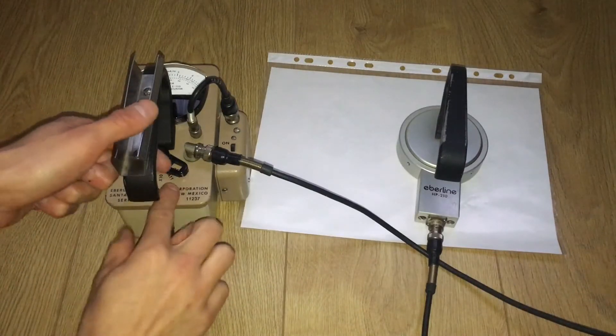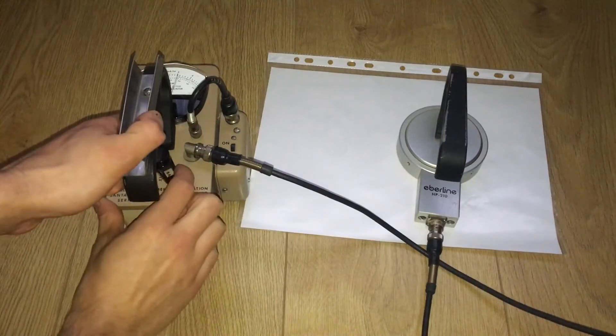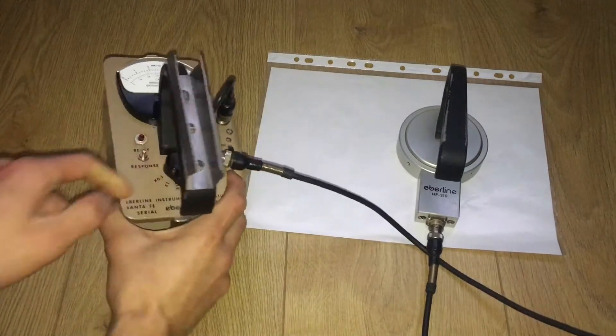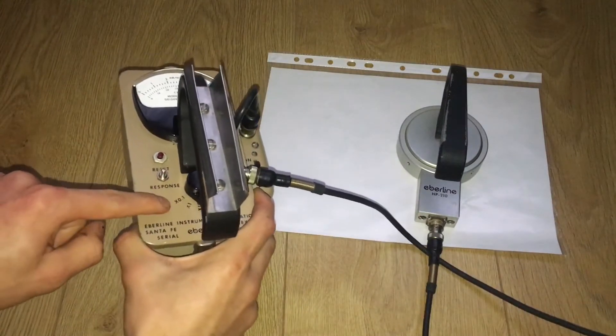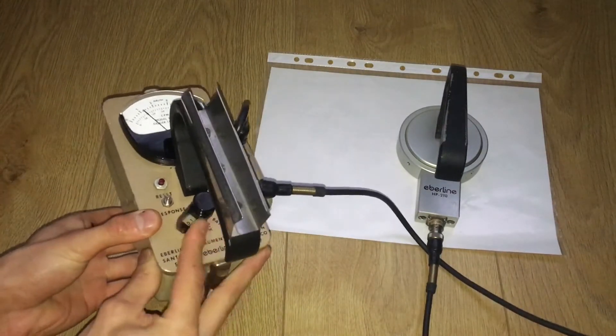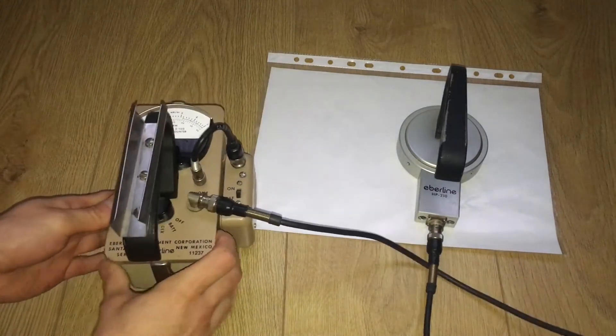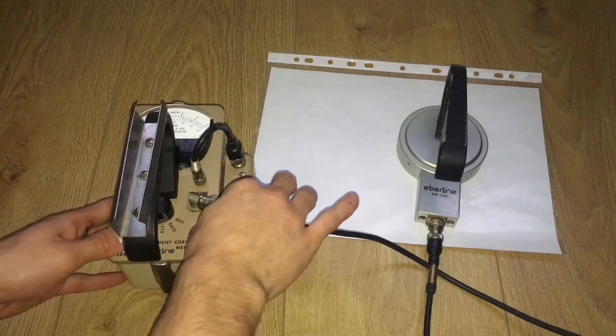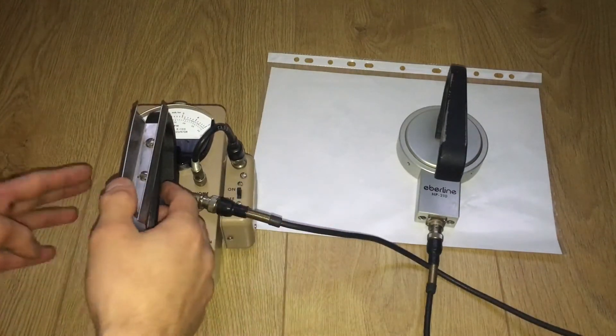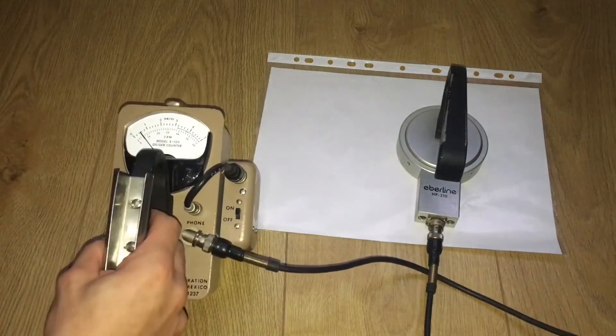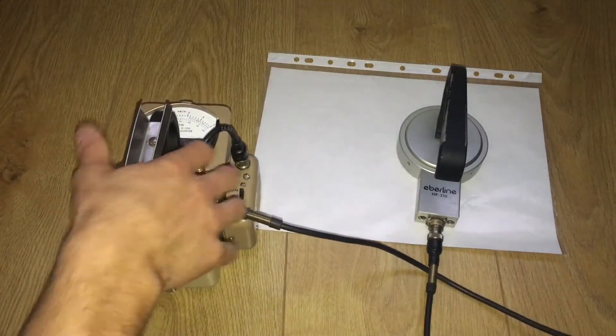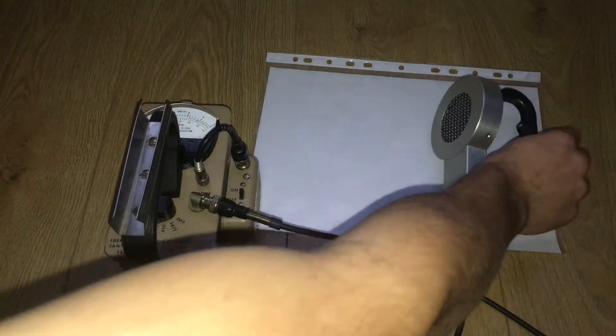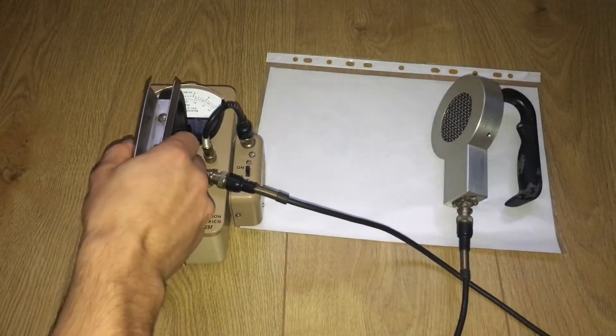Let's turn on the unit. We're going to put it to battery check - all good. And we're going to switch it to times 0.1 mode and see if the speaker is working. It's reading background radiation. This probe is very sensitive.